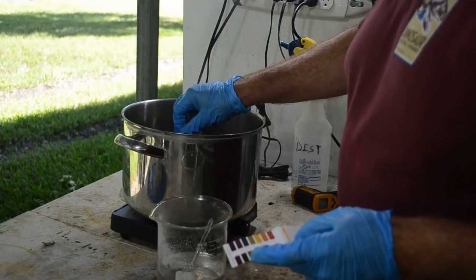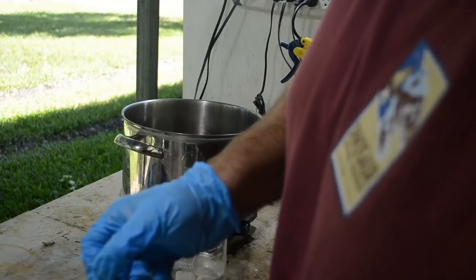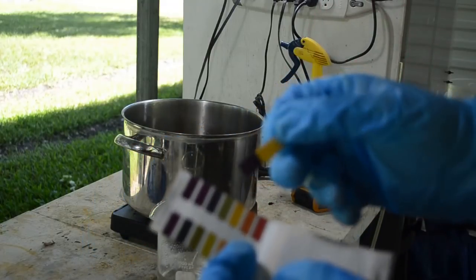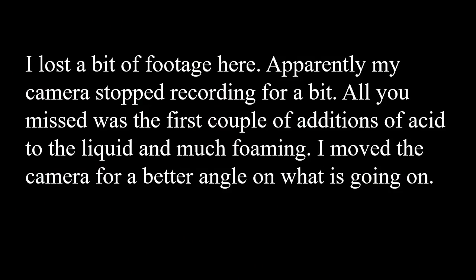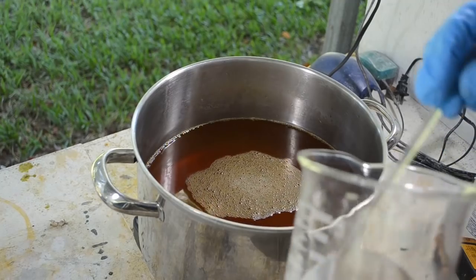Anyway, let's get a first look at the pH of this stuff and see where we are. Oh yeah, I would say we are somewhere just north of 10. It was probably 13 or closer to 14 when we started, but I hope that's showing up. Yeah, so we're probably somewhere a little north of 10. Okay, here you go. Now you've got sort of the Julia Child cooking angle on what's going on here.